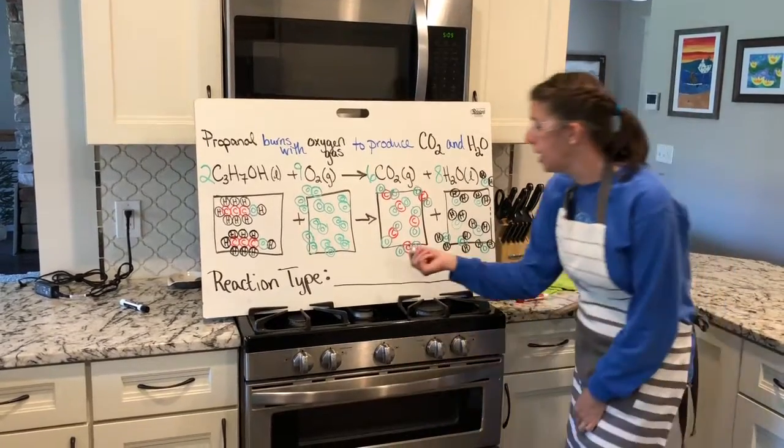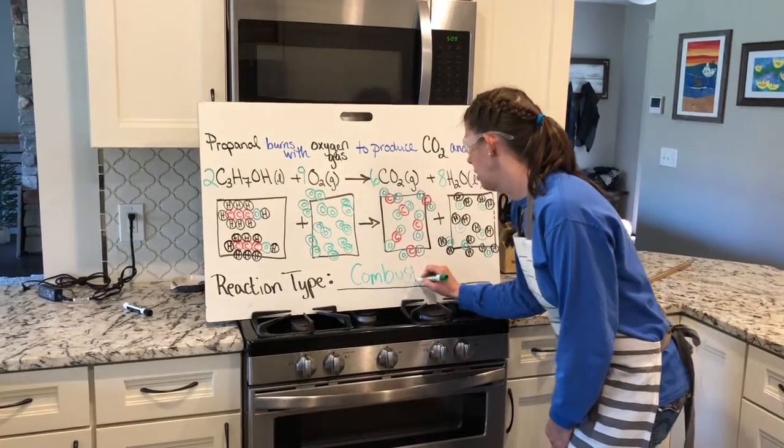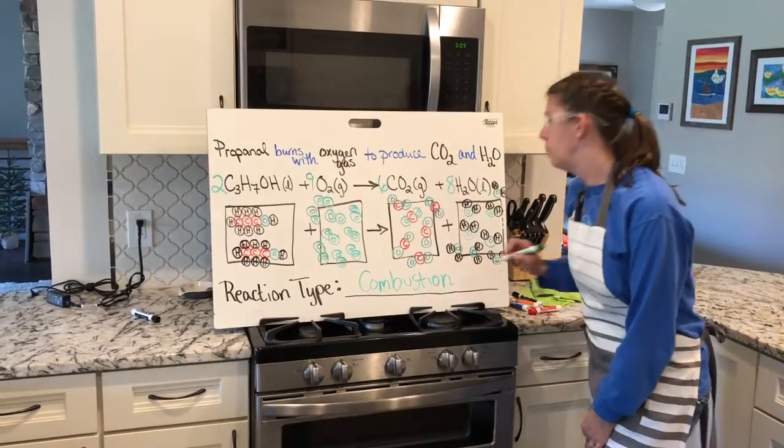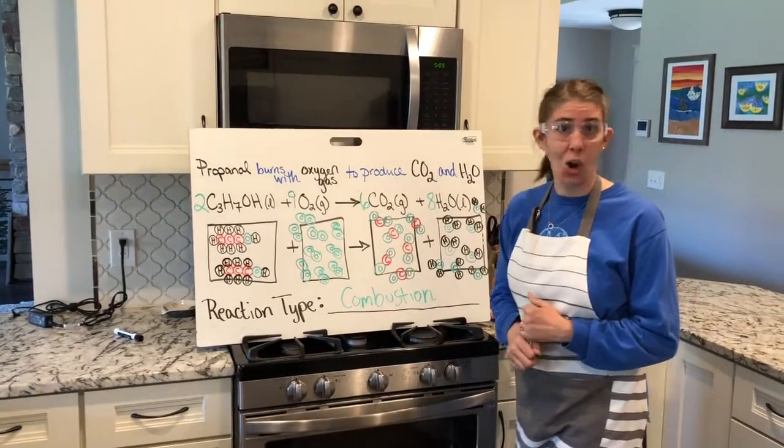All right, so this is a combustion reaction. I hope you enjoyed it. Please don't try it at home.